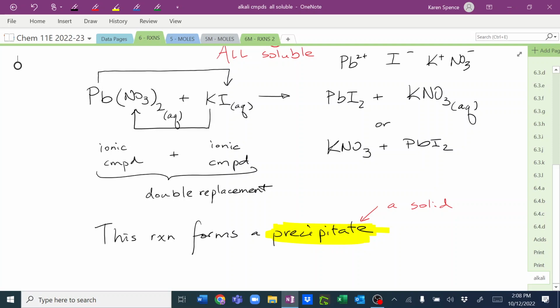How much did I turn it on to? 10. I don't want it to go for 13 minutes, but it doesn't work if you turn it on to like 1 minute. It thinks you're wanting to slow down at that point. Okay? So just turn it on to whatever, and then when you're done, we just wait for a little minute here. We could sing the Jeopardy song. Are those the numbers for time, not speed? Time, not speed.